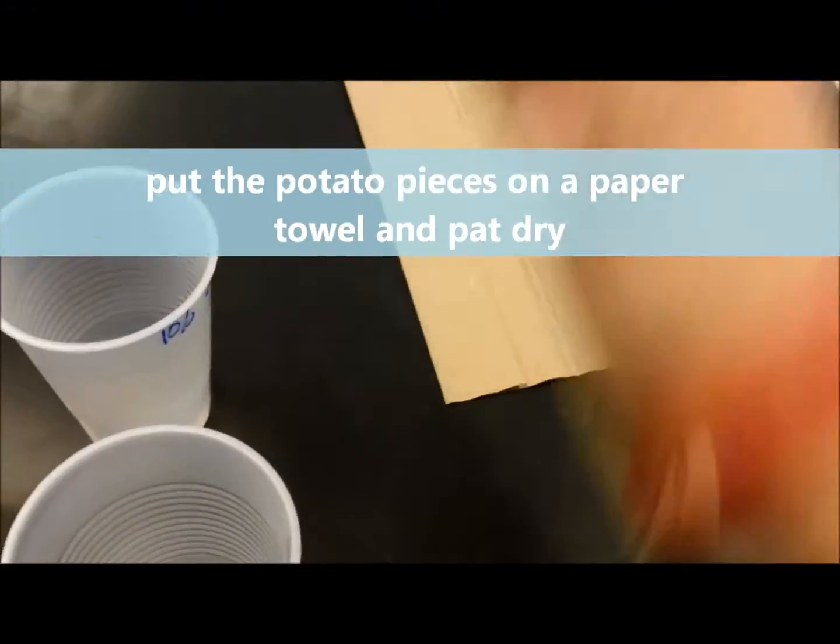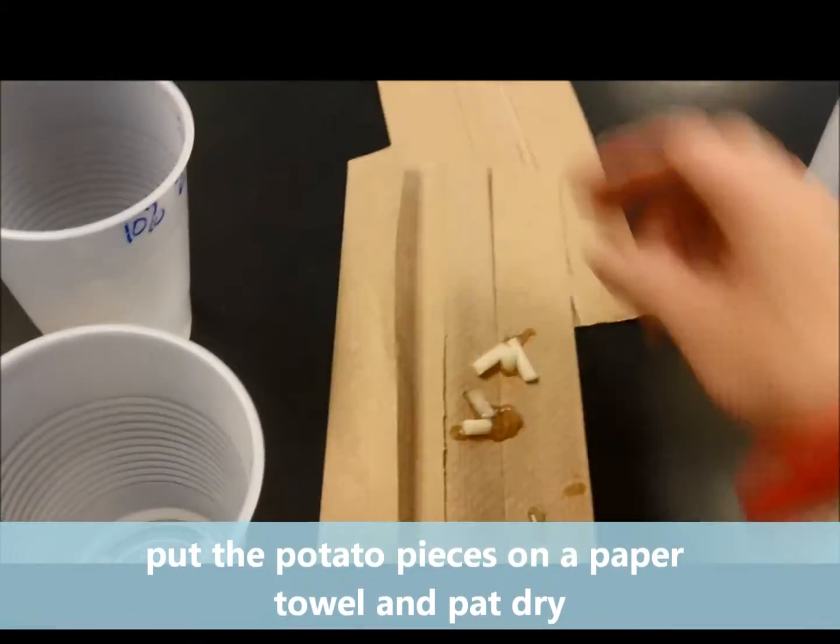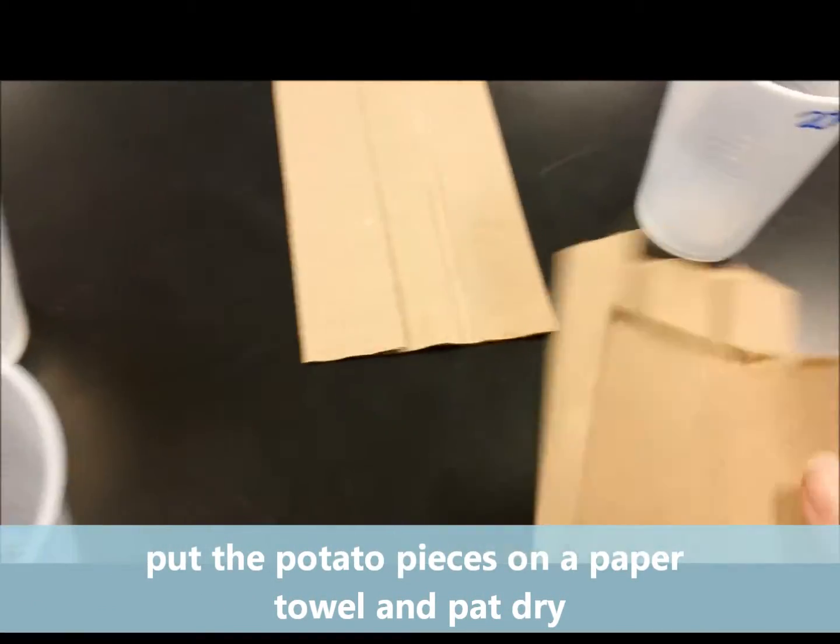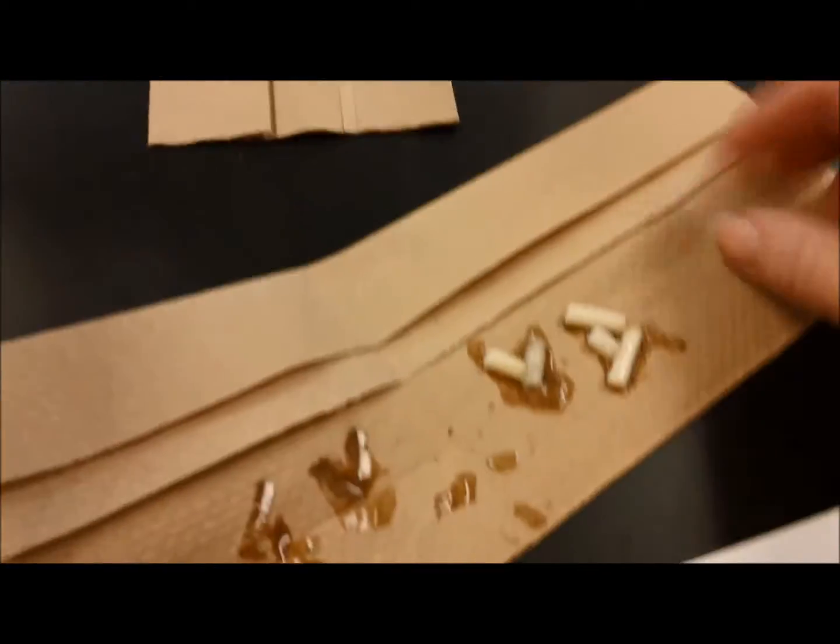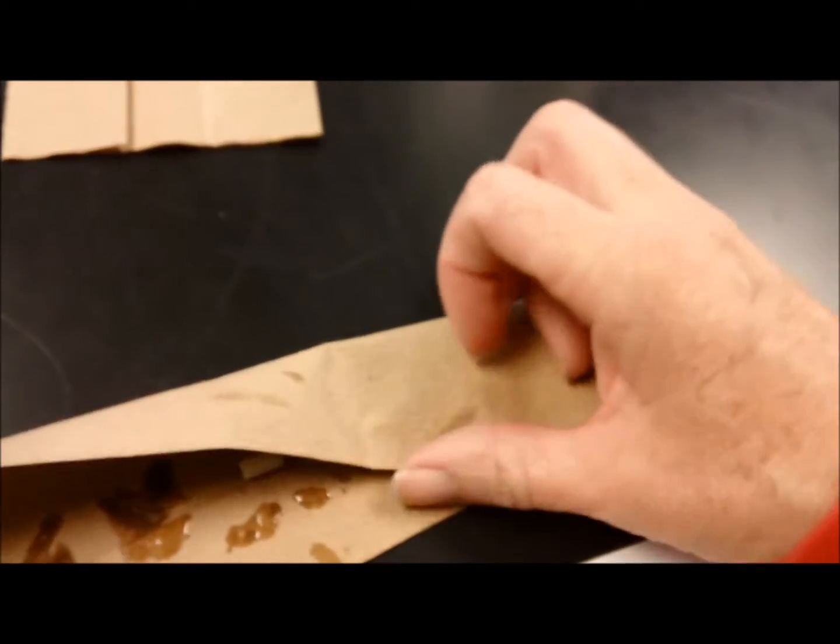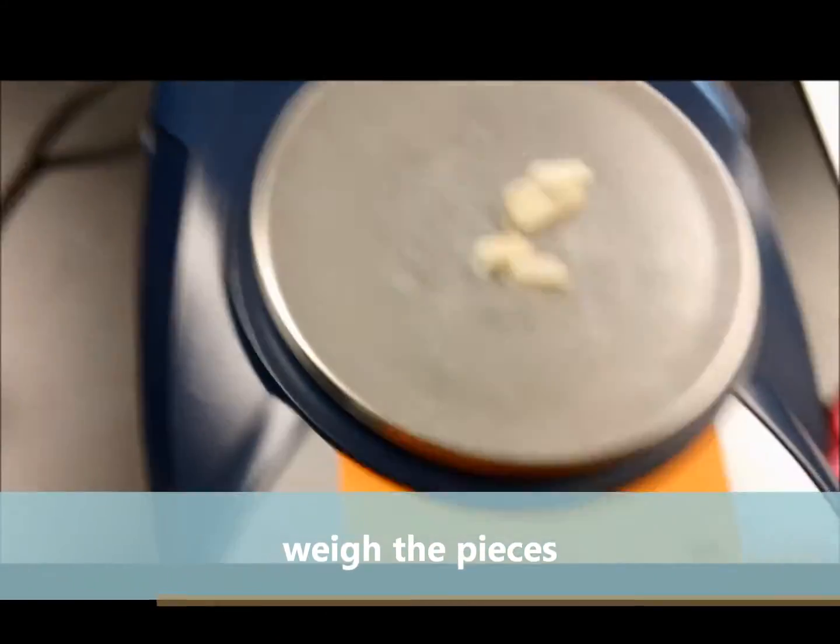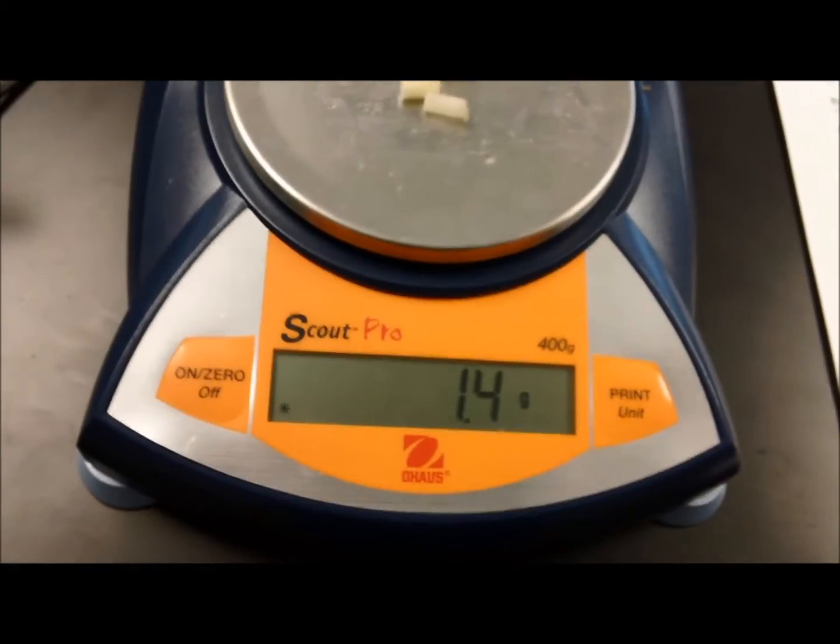Then we'll put our potato pieces on a paper towel. We only want to weigh the potato pieces, not any of the water, so we'll pat them dry to get rid of the excess water. Then we will weigh them. This was our 20%, and we see that it has stayed the same.